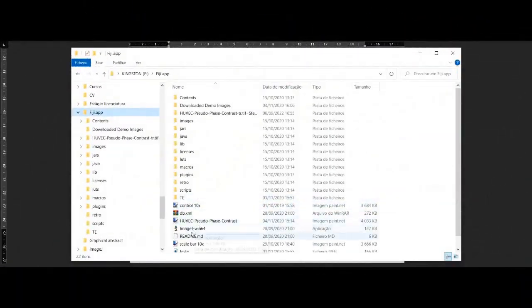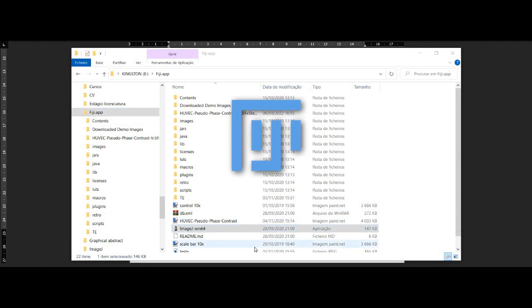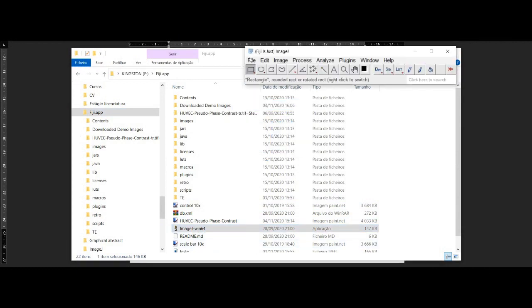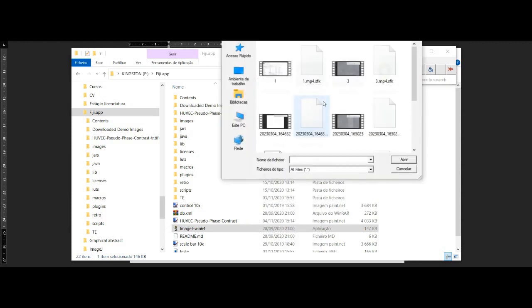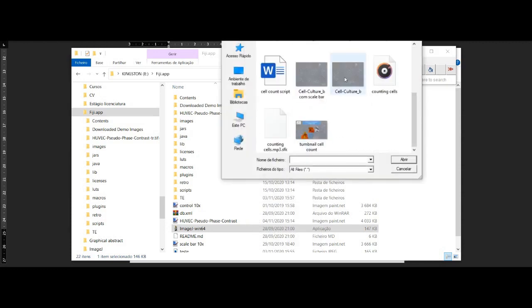Before we begin, let's make sure we have ImageJ installed and ready to go. Now, let's open ImageJ and load our image that we want to analyze.